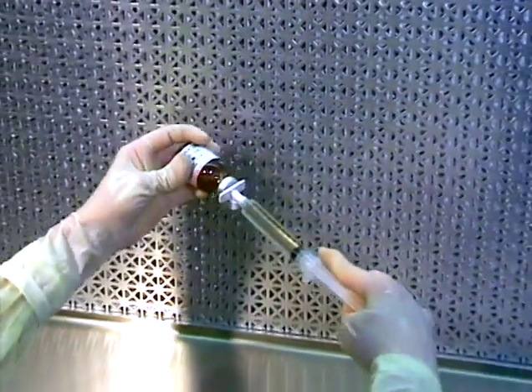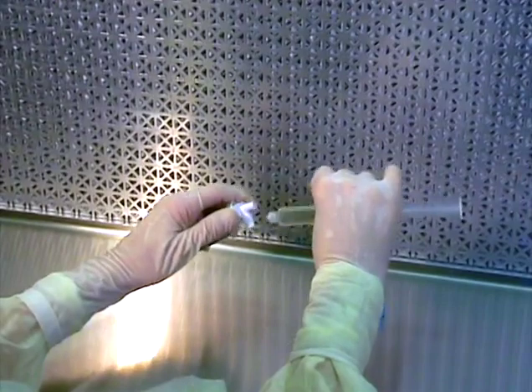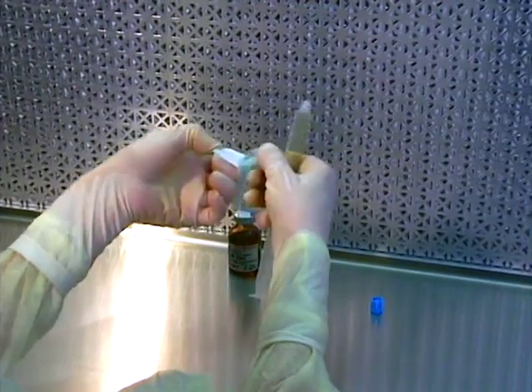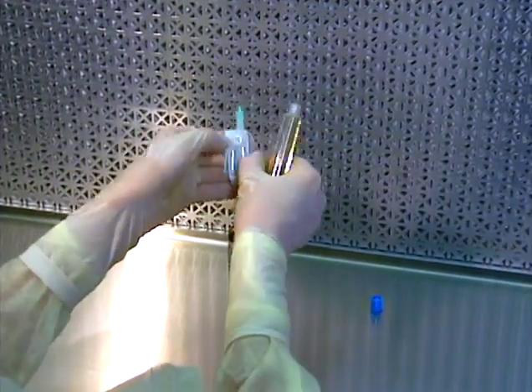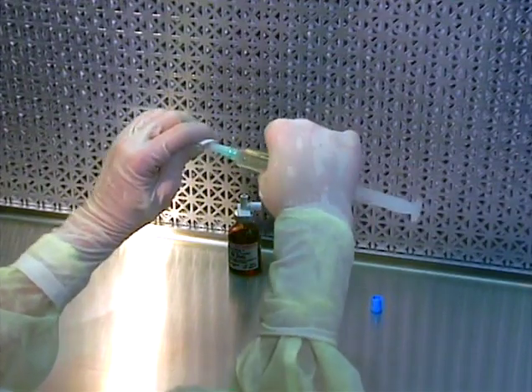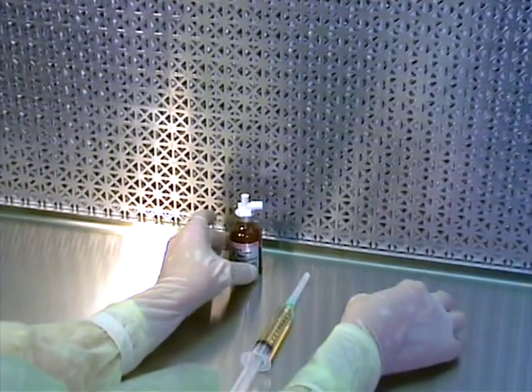Turn the assembly to the horizontal position and carefully twist to unlock the connection between the syringe and dispensing pin, tipping both so that the open orifices are pointing upward as they separate. Set the vial aside in first air and attach a needle or syringe cap to the syringe, as required. Aseptically replace the dispensing pin cap.